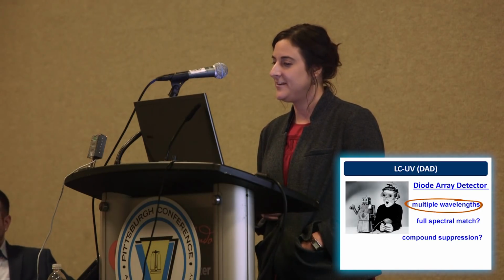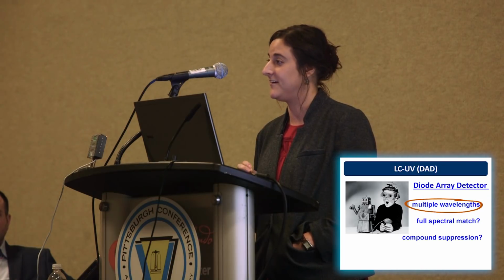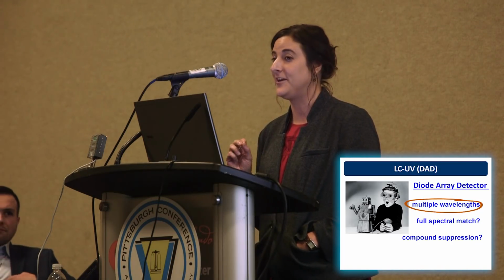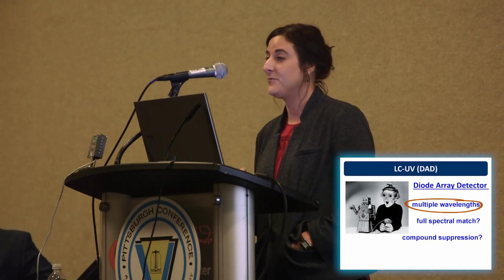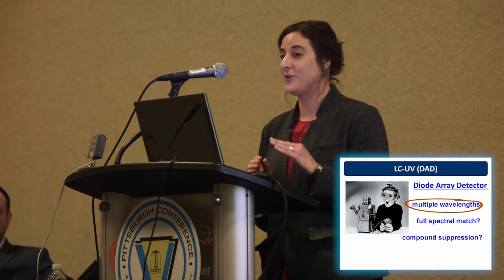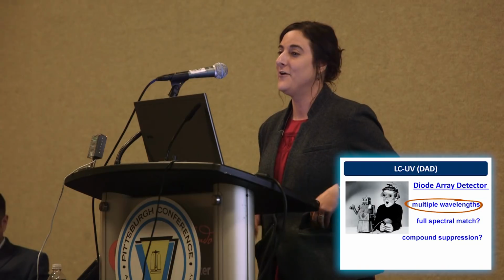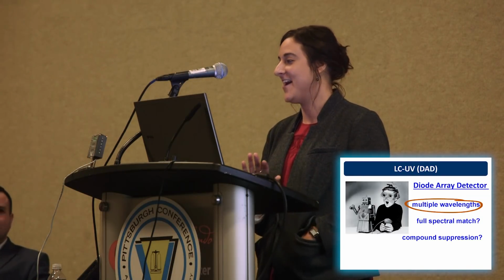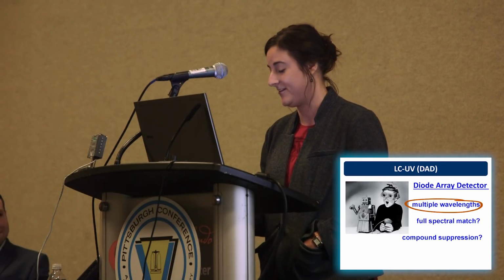So the last time I did LC-UV, I'm not kidding you, I was in grad school teaching analytical chemistry, looking at caffeine in drinks, and we had a strip recorder. For the young people in the room, that is where you have a printer, and your chromatogram is being drawn as the sheet is coming out. So for me to sit down at this is super fun. This is my new toy, honestly.